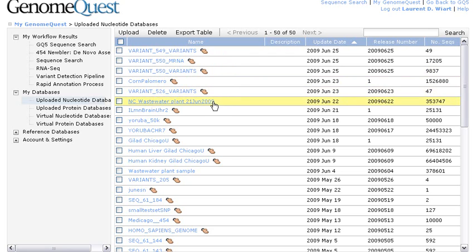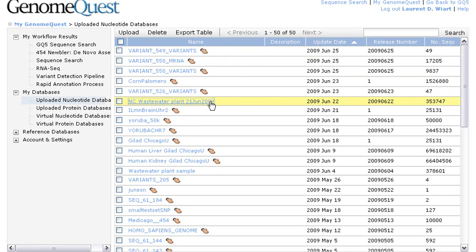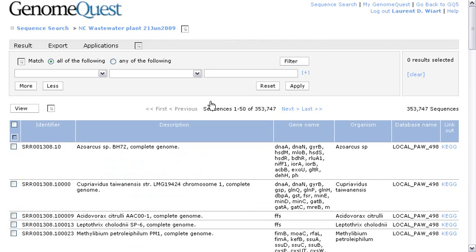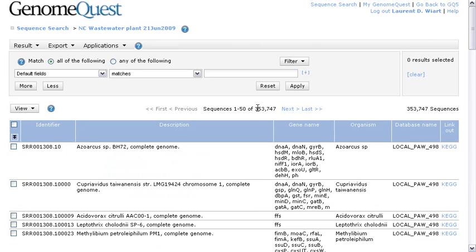And here, I want to focus on this specific data set called NC for North Carolina Wastewater Plant. I'm going to open this database of reads, 454 reads, from a sequencing experiment done with a 454 FLX platform. And now, I'm browsing those 353,000 reads here on this page.